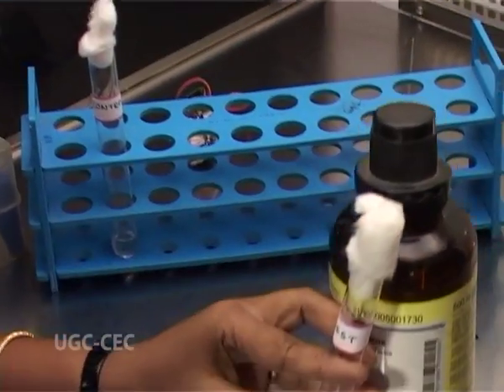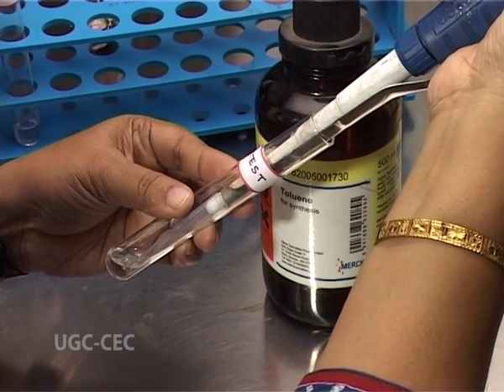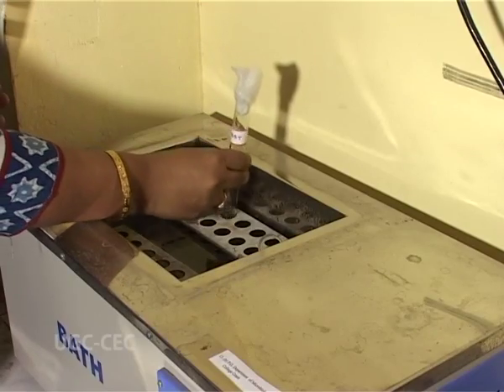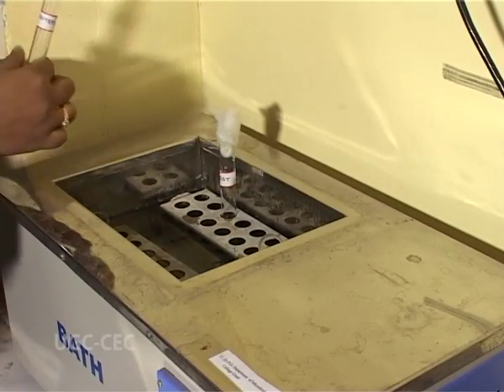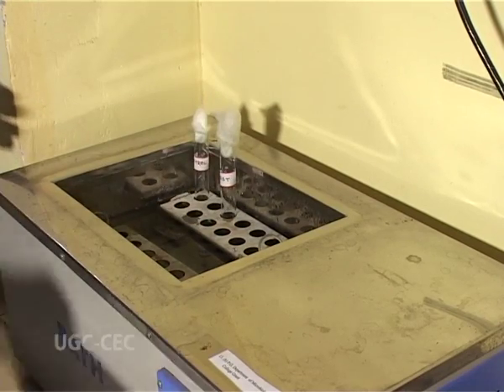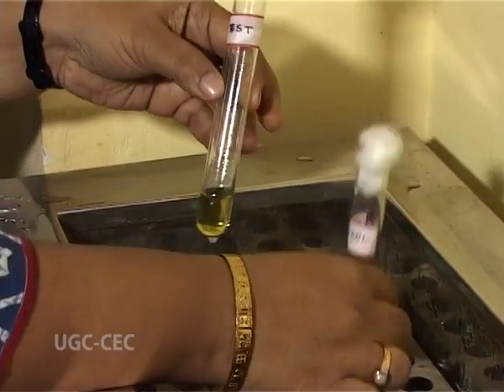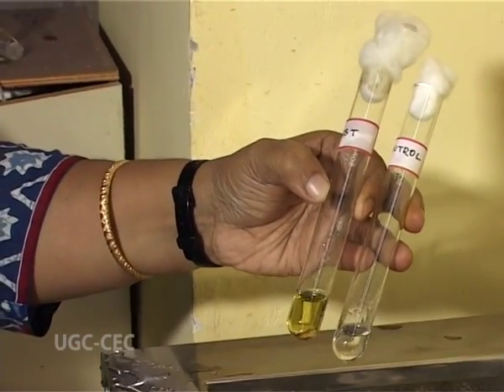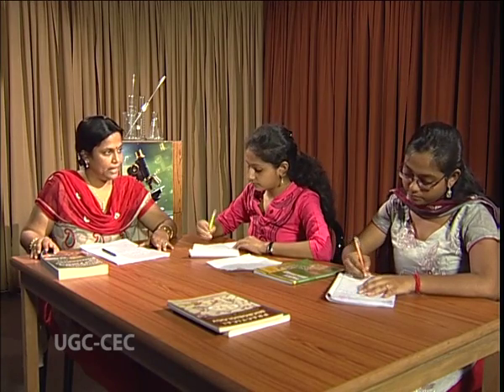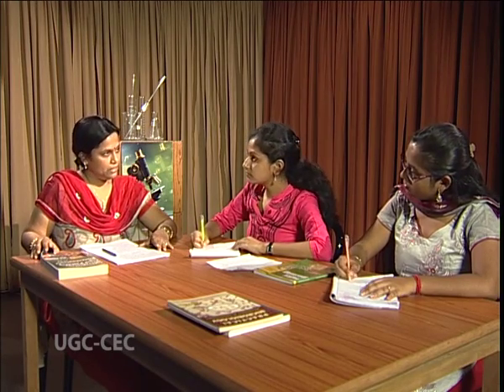One tube is called the control, where we haven't inoculated any bacteria, and the second one is the test one, where bacteria has been inoculated. And this entire thing is incubated for 5 to 20 minutes in a 37-degree water bath incubator until a yellow color develops. This yellow color is indication of generation of orthonitrophenol. It means orthonitrophenyl beta-galactoside has been broken down by the enzyme beta-galactosidase, right? So once qualitatively we have estimated that the bacteria is synthesizing beta-galactosidase, we really need to quantitate our result.